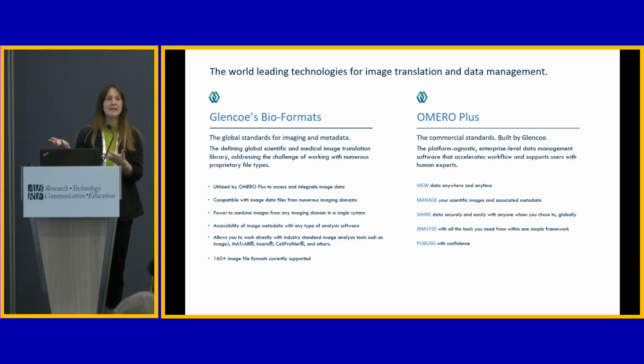So Bio-Formats is an image translation library. It's also available open source. It's integrated into a lot of different open source software, so you may already be working with it in a variety of contexts. And it doesn't mean that you're converting your data. It means that we've effectively reverse engineered readers for all the popular file formats in bioimaging. And what that means is that tools that use Bio-Formats can read image data and metadata from those proprietary file formats and present them in a uniform manner. And so OMERO Plus uses Bio-Formats behind the scenes to be a vendor and domain agnostic platform. So Bio-Formats currently supports over 160 different file formats.